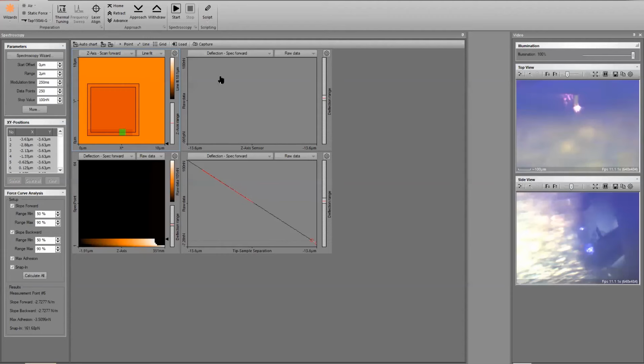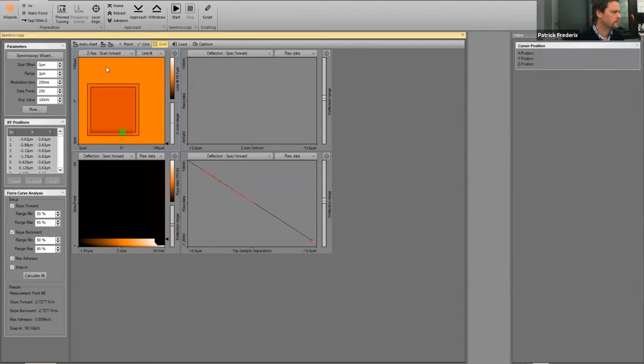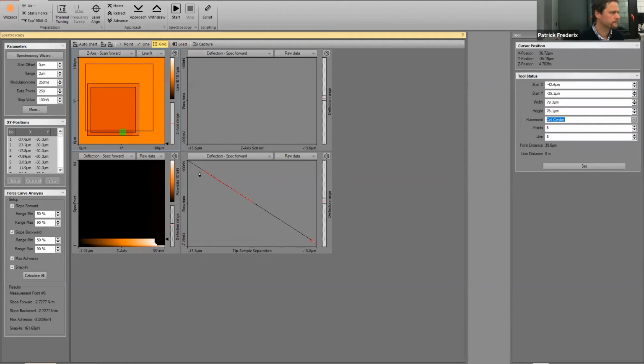I don't see a screen. Oh, sorry. Now it's showing? Yes. Okay. So if I load the data here, yes, now it's 100 micrometers, closer to the scan range. And now you can get a larger map. Okay, I hope that answered the question.